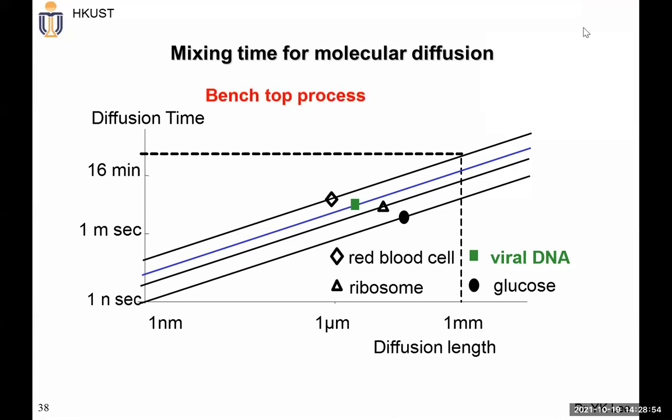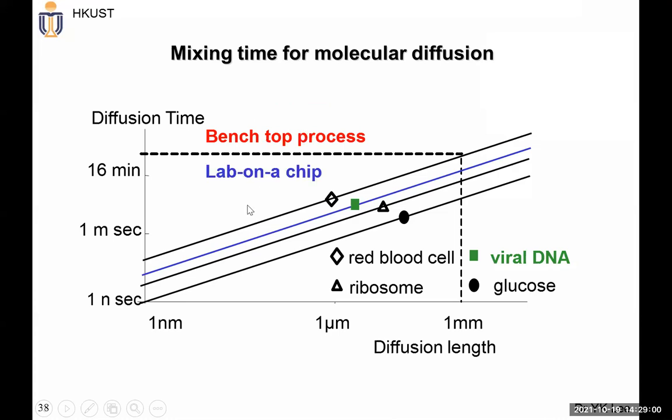Then we are able to come up with much better and faster devices, going from benchtop to lab-on-a-chip microfluidics. This is another quite important motivation for making microfluidic devices. And of course, in this COVID-19 pandemic, there is pressure to come up with better, low-cost microfluidic devices for detection of virus or DNA, right?